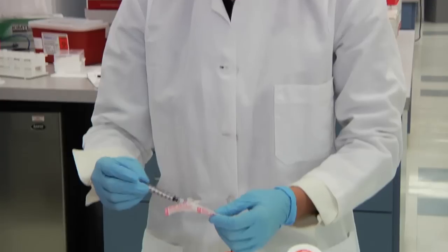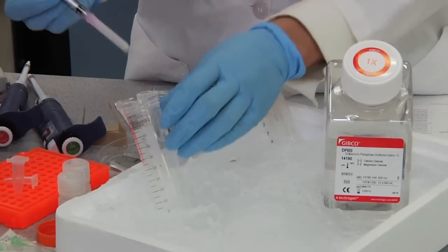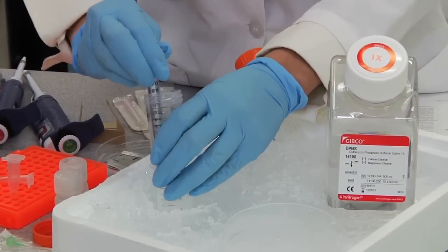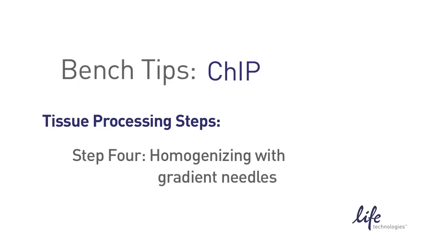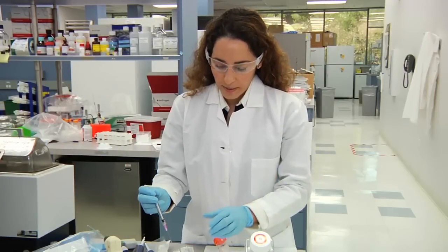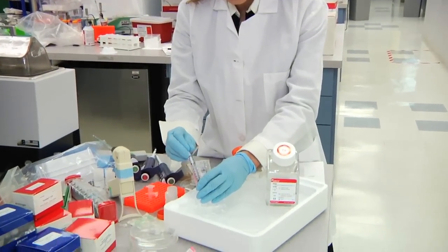We're going to further mash the tissue by adding a 1.5 mL 18 gauge needle onto your 1 mL syringe. Make sure you keep the sheath on and mash the tissue further to make it easier to homogenize in the next steps. Then remove the sheath and pipette up and down 10 times to homogenize the tissue using your 18 gauge needle.